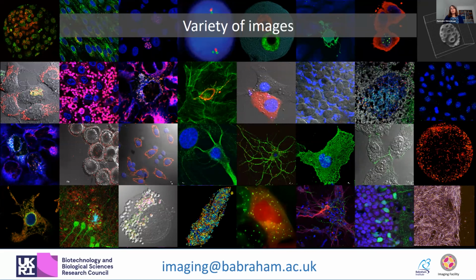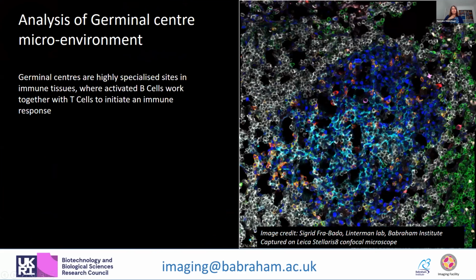And of course, the talk, being only 10 minutes, would be way too short to go into all of them. So I've just selected this one over here to concentrate on. And the main message that I would like to give regarding this image is that it's a germinal center.